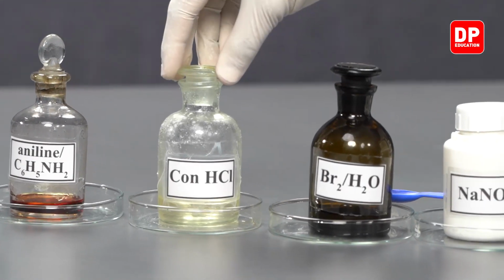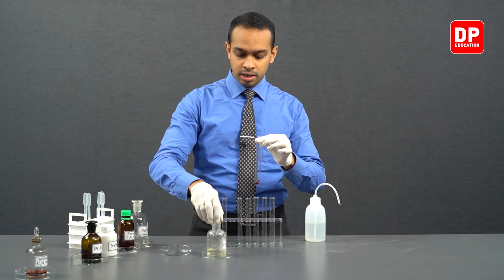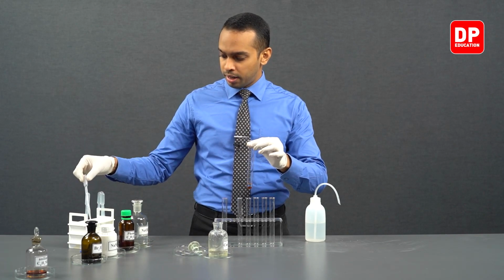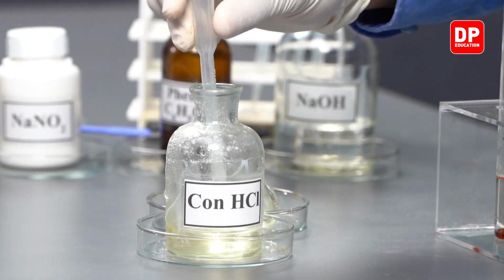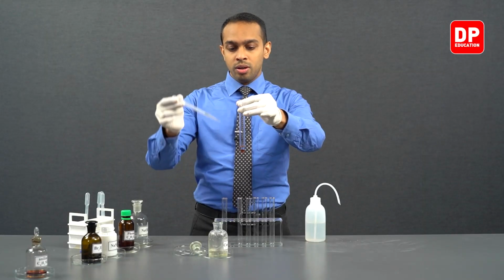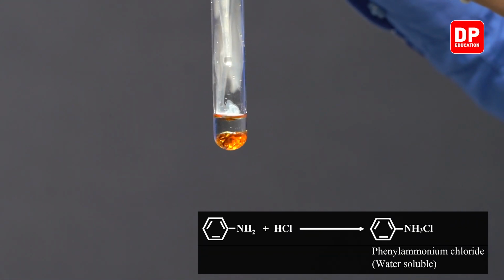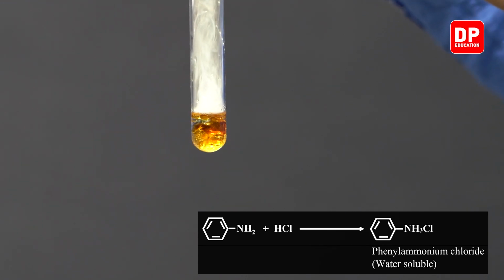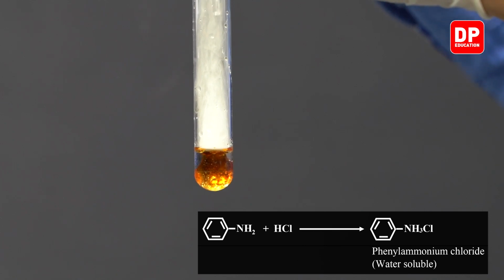So we have our concentrated HCl over here. Let's take our concentrated HCl solution, and we'll add a small amount to see what happens when we react HCl with aniline. As you can see, when we add HCl little by little, the aniline starts to react.